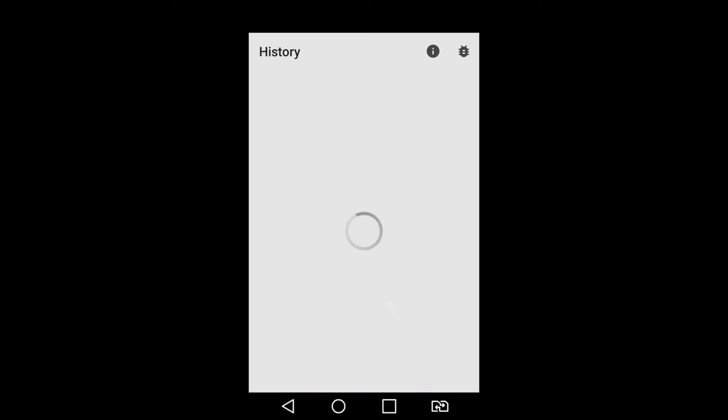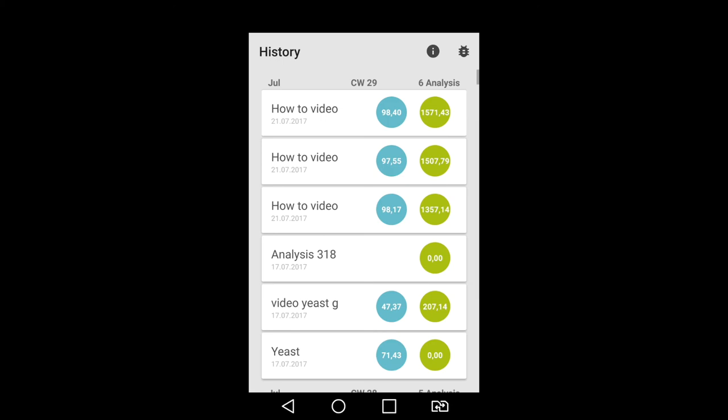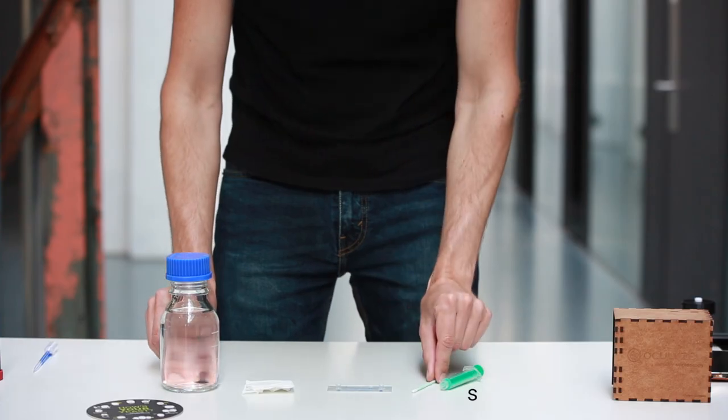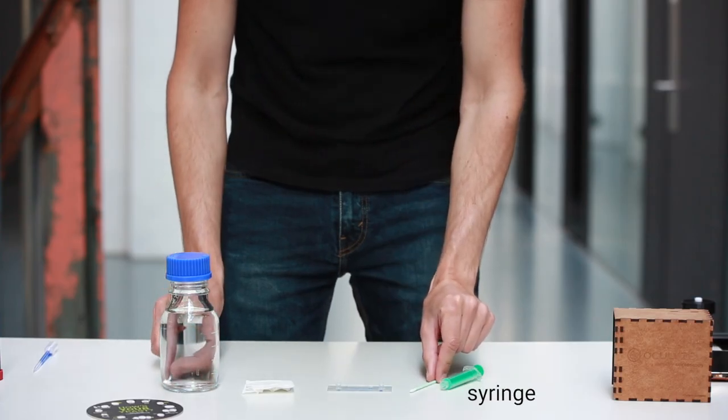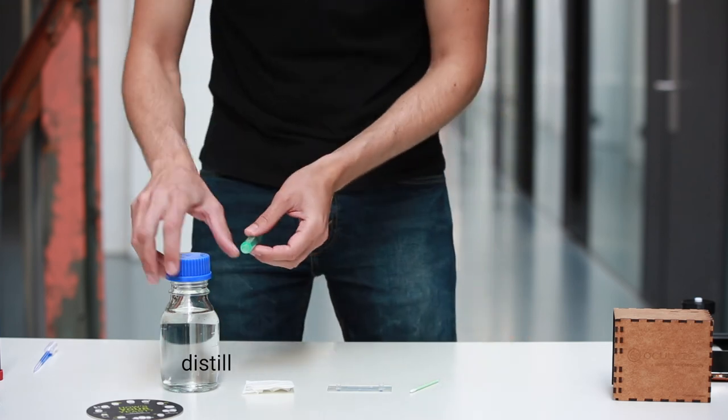View previous results in the history tab from the app home screen. In order to guarantee optimal analysis, the chamber must be cleaned and dried after each use. Step 1. Fill the syringe with distilled water.